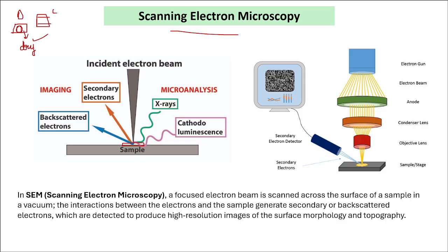Now, this carbon tape is used basically to increase the conductivity. So whatever sample you put, either the glass slide or anything, needs to be put on the carbon tape. Put your powdered sample on this carbon tape and then put it on this sample stage. We'll see that. Now you put your sample here.